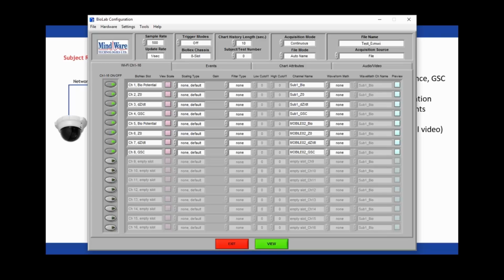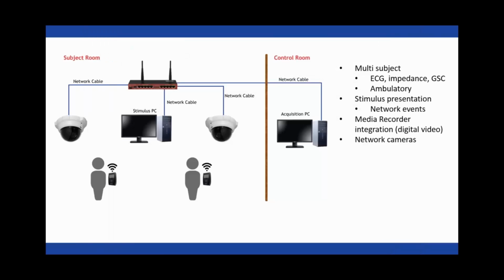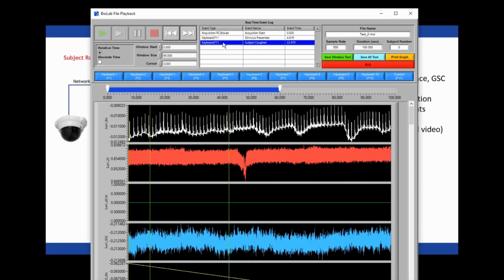Okay, and then we've got one last question, which is, can I move events that were placed incorrectly? And unfortunately, you cannot do that, but you can delete them and re-add them. So when we were on the viewer screen before, I showed you that you could delete events. So let's say that this second keyboard event was incorrectly placed. I can just remove it.